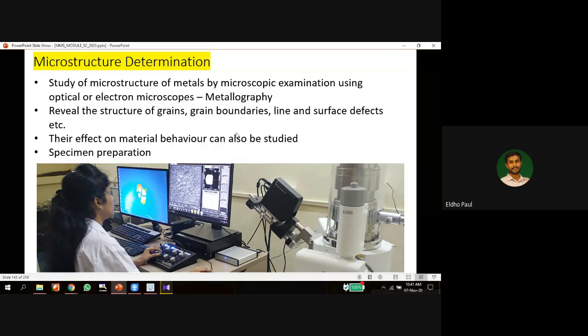So far we discussed different aspects of microstructure: what the shapes of grains are, and what the different defects are in the microstructure, or the arrangement of crystals in a crystallographic material. To identify the defects, or to find the shape or size of the grains, we need to see the microstructure of the material.